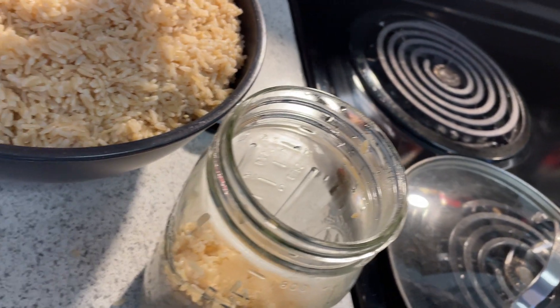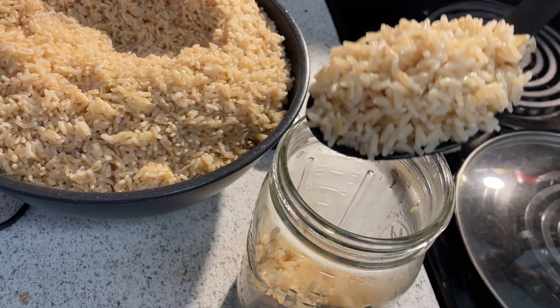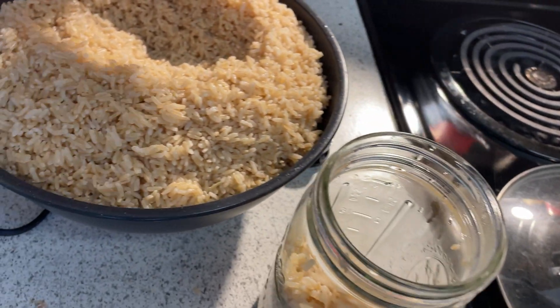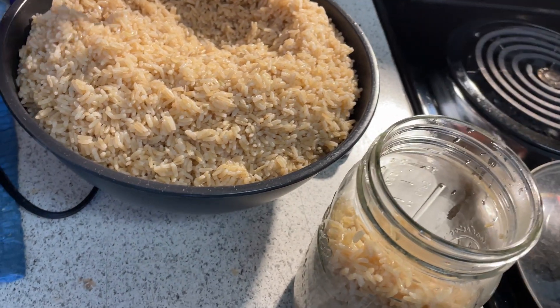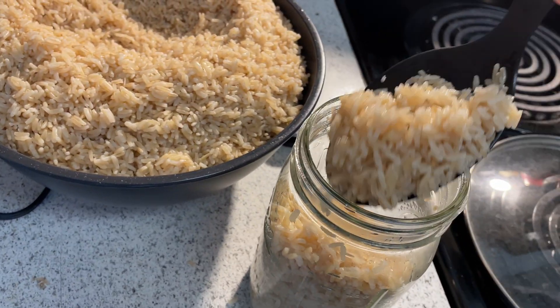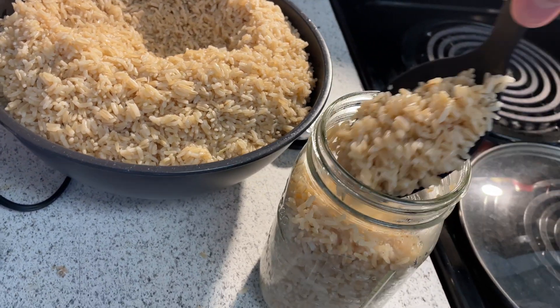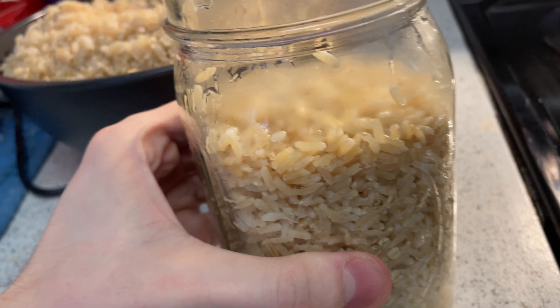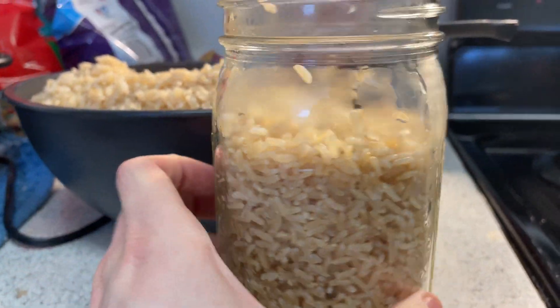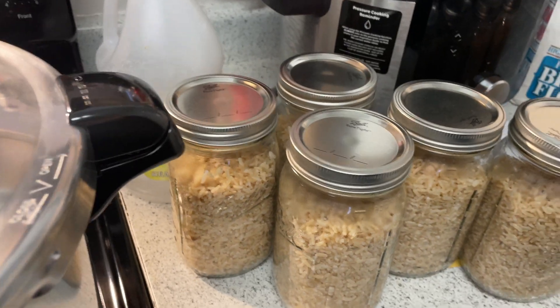If you end up with too much rice in the jar, you won't be able to break it up or shake it during colonization. And if you're getting up to the top, just be careful because the harder you shake and break the jar, it very well could break in your hands. We've got all seven jars lined up looking real good — perfect, right where we want it. Got them ready for the pressure cooker.